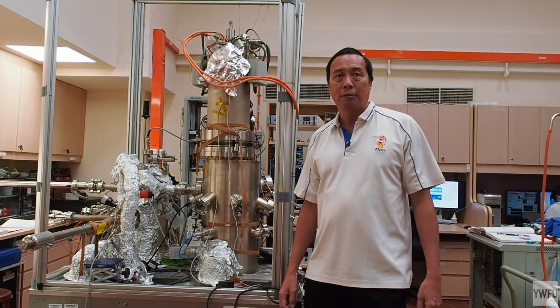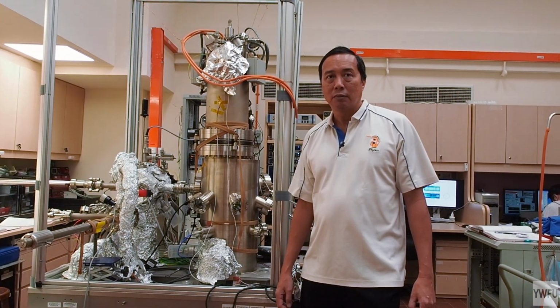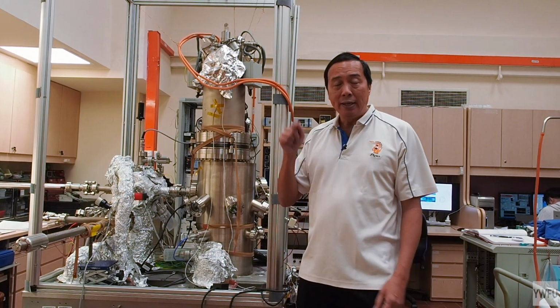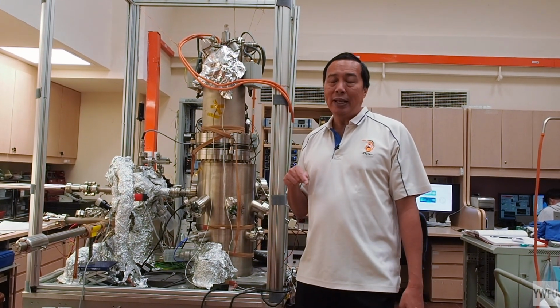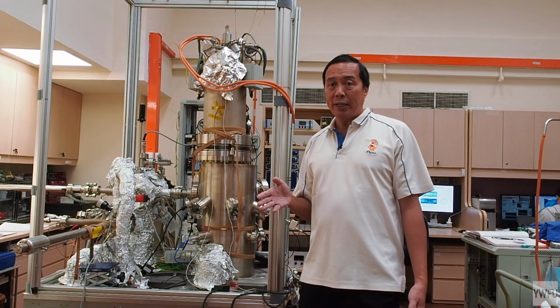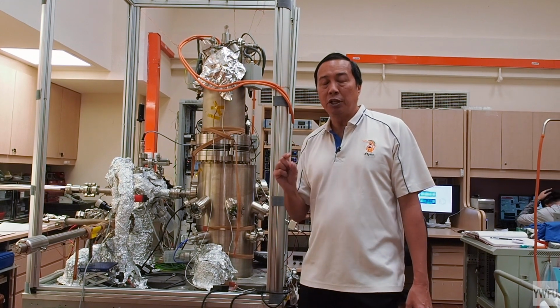Are there any types of samples that STM won't be able to image, or AFM won't be able to image? Yes. STM requires a tunneling current to flow. Hence, any insulator cannot be done by STM. But AFM can do scanning on insulators as well, since you're just measuring the force.